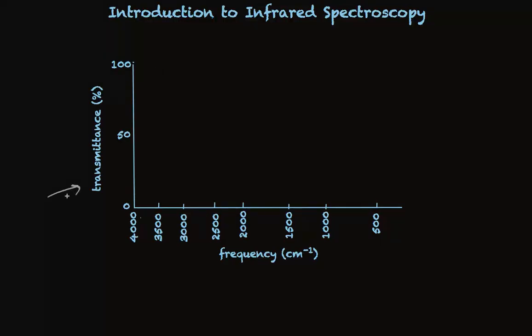this is transmittance, which means then no energy is being absorbed. There'll be 100% transmittance. Nothing is happening. It's way up here. When energy is absorbed, we'll see a change in the spectrum like this. And then as we change the frequency, when it's not absorbed anymore, it'll go back up here.